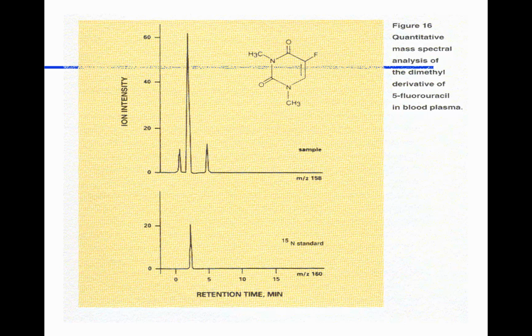And so if we know this corresponds to a certain concentration, we can just simply proportion. If this peak's 10 times bigger than this, there's 10 times more than this. So it's really a beautiful internal standard. You know, when you choose internal standards for a method, you always choose something that's closely related to the compounds you want to measure. It's just good practice, so they behave like the compounds you want to analyze. And there's no better standard than the compound itself, just 2 mass units bigger.